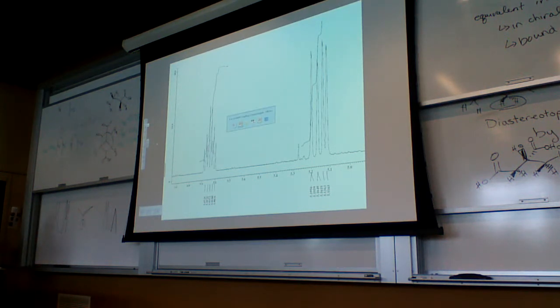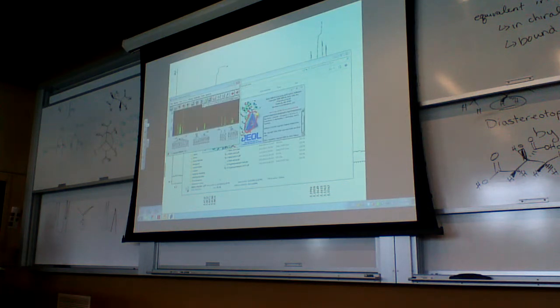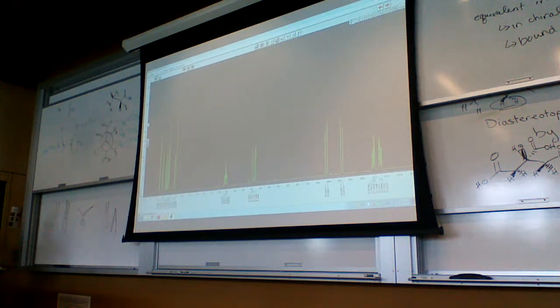Let me load up that spectrum. We're going to confirm that once we go through the coupling, but it's one hydrogen and it looks like it has some larger values of coupling. I may be off on that assignment, so we'll check our coupling and then decide what we want it to be.